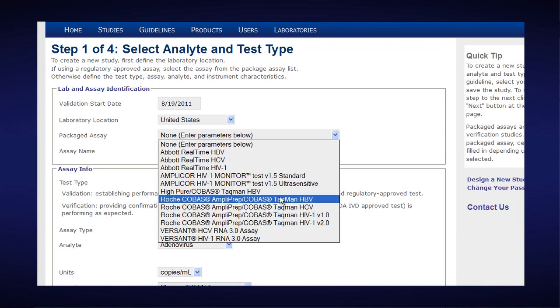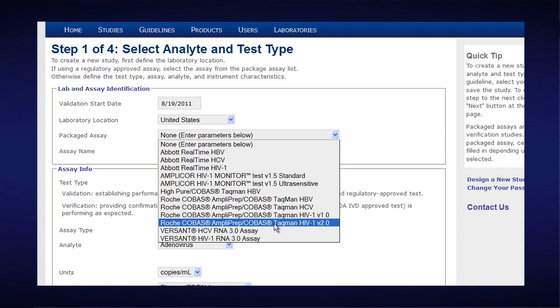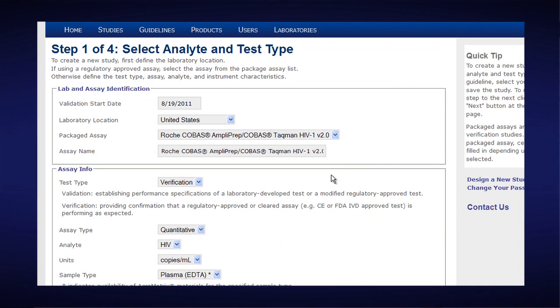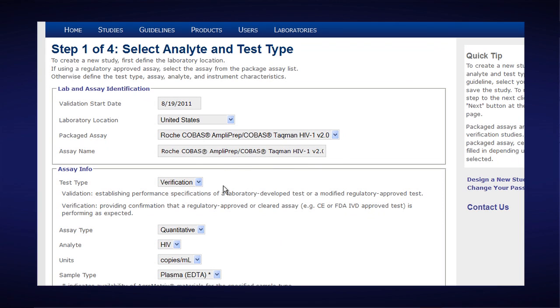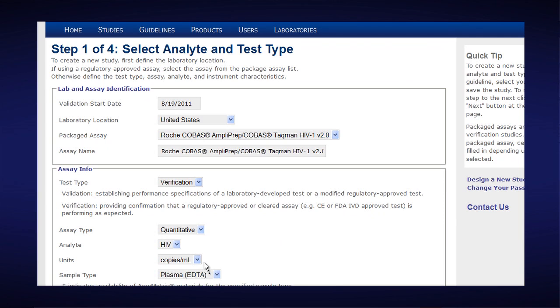In this case we'll enter HIV 2.0 and it automatically populates an assay name which you could change if you prefer. It's a verification because this is an FDA cleared test. It's a quantitative assay. We're testing for HIV. We're testing copies per mil and plasma EDTA is our sample type.